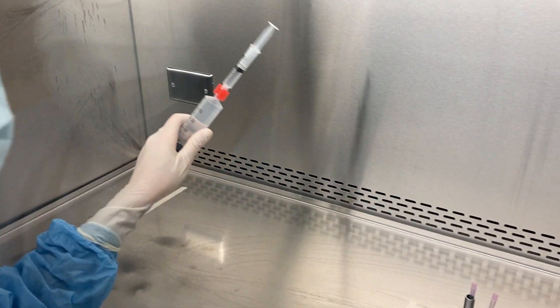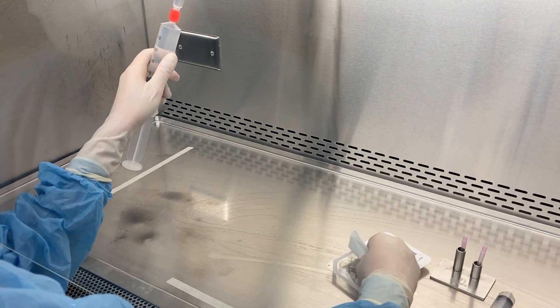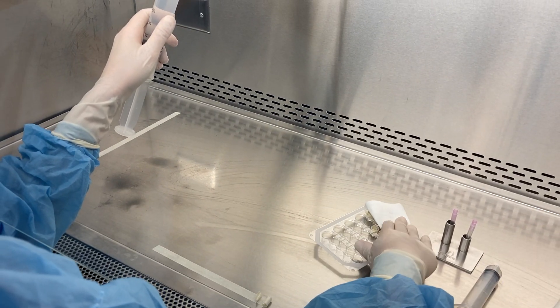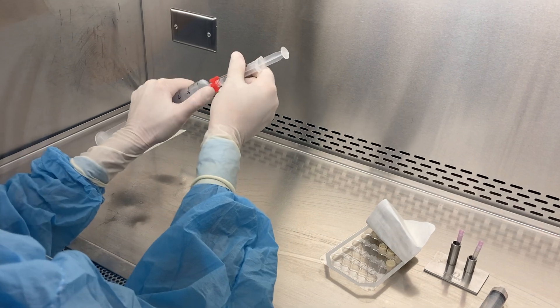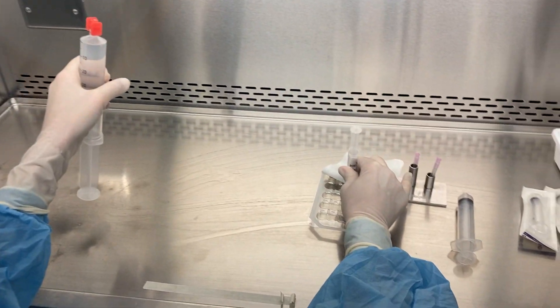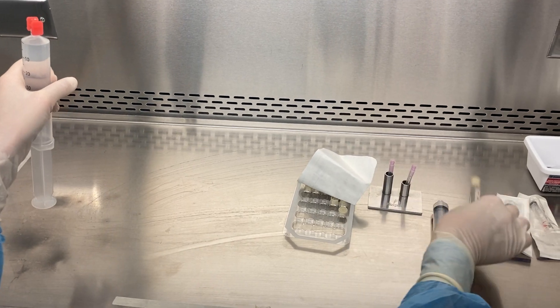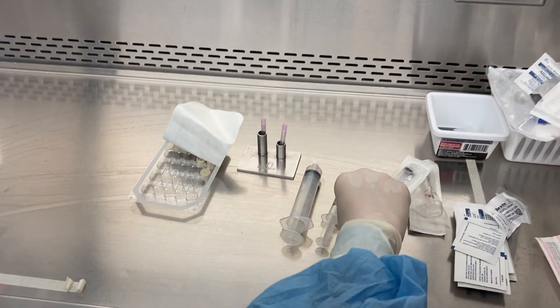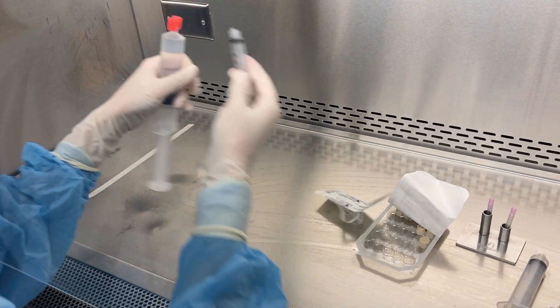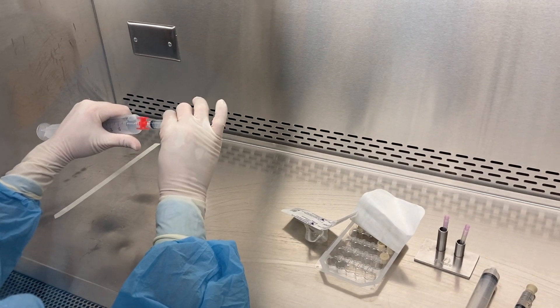And if I was dispensing it in a syringe, I would then pull back my TipTap packaging, move my syringe, and attach a TipTap. And I can repeat that with all remaining syringes.